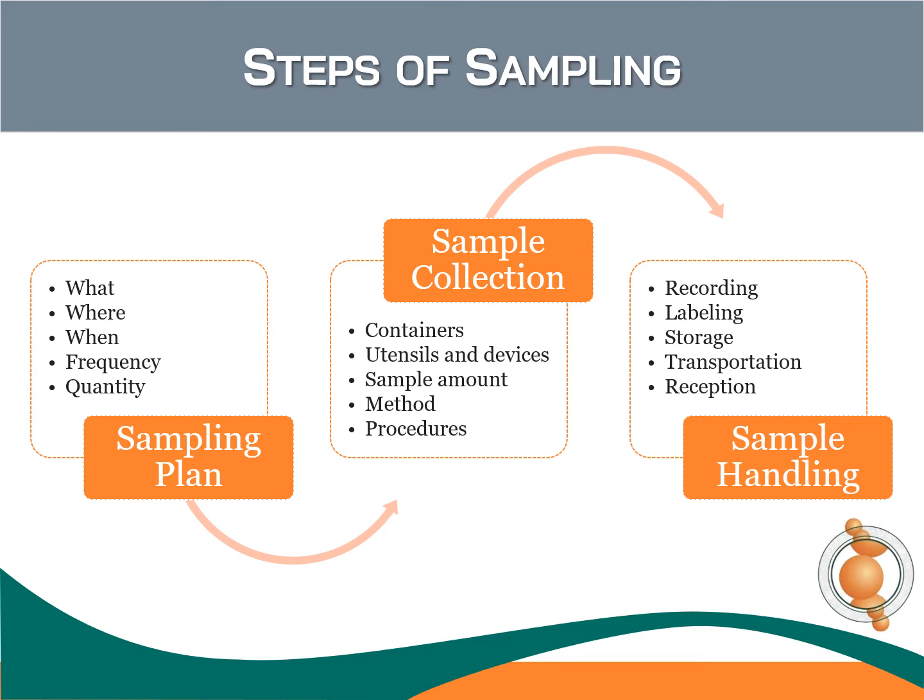The second step is the physical collection of samples. You will need proper containers and tools to take the samples, making sure you take enough samples, and following correct methods and procedures to collect samples that are suitable for analysis.